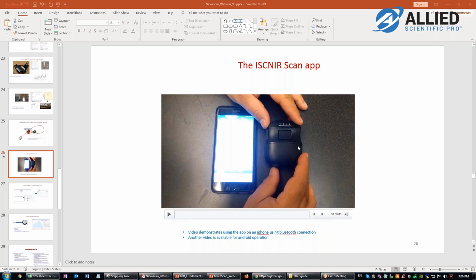That's right. But the issue is that if your surface is very rough, you have to be careful not to scratch the window of the instrument. You have to place it gently. Even on a rough surface, you could do the measurement, because I did it on mineral rocks. I was very careful not to scratch the window. I placed it very gently. What is the window material? It's sapphire. Okay, all right. You just carefully place it on the surface, right? Yes.